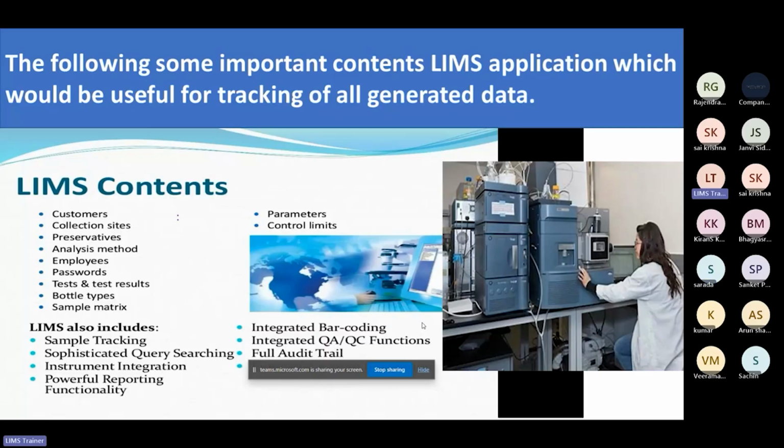These are just basics: why LIMS is important and how LIMS helps to improve laboratory functionality. That's it. So is it clear? Yes. Okay. Can anybody tell me what is an audit trail?